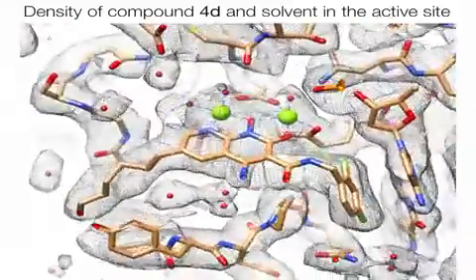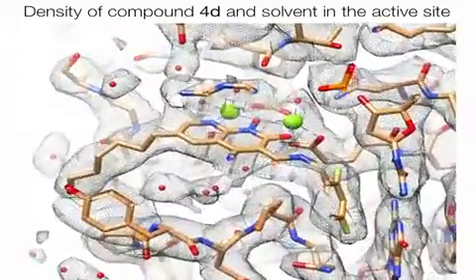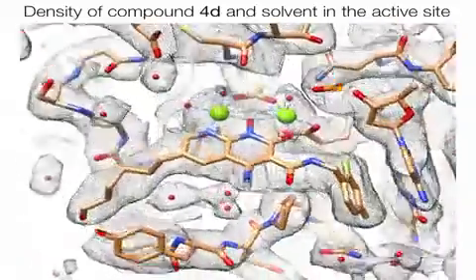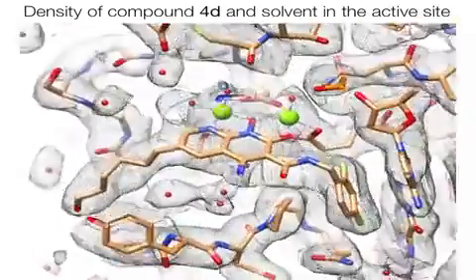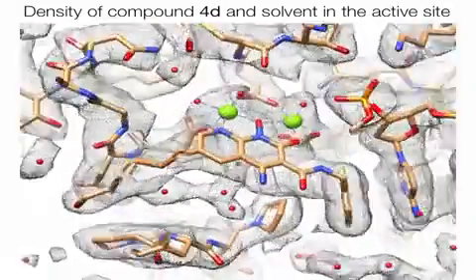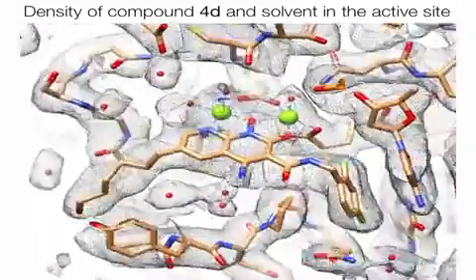And one of the things that we came to appreciate throughout the course of this project is the relevance of bound water molecules. You really only see them once you start getting to sub-3 angstrom resolution. But in this particular instance, that extra fraction of an angstrom was really important for improving our understanding of the active site and the ligand binding.